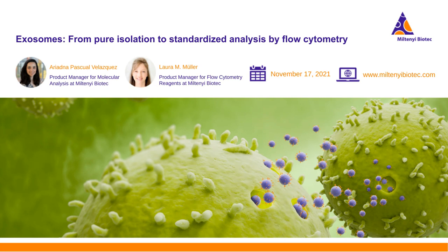Thank you so much. Is it possible to customize the magnetic beads with streptavidin to capture biotin antibodies against specific cell-derived EV markers? I can give a little bit of information here, and then maybe Stefan, you can elaborate a little bit on that. I think it is potentially possible to customize or to use streptavidin microbeads to capture EVs that are labeled with biotin.